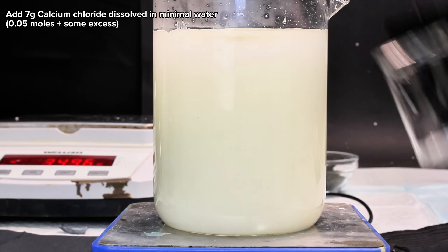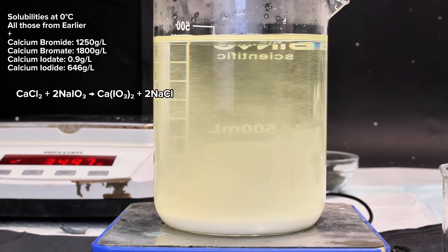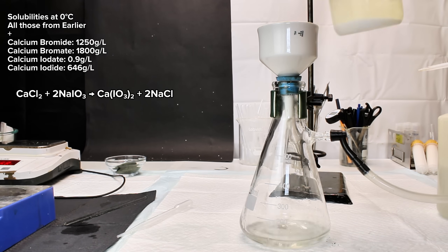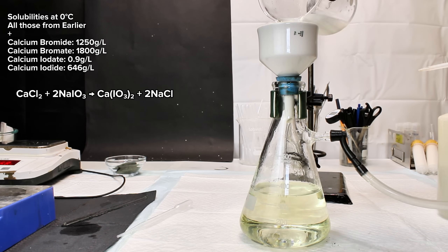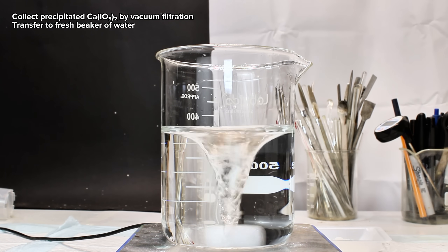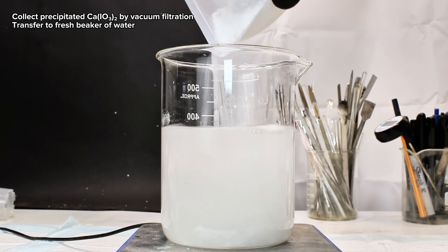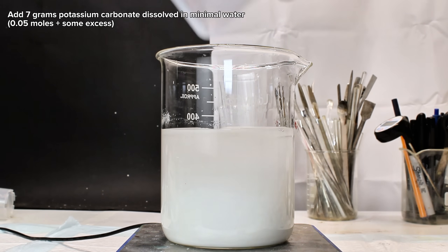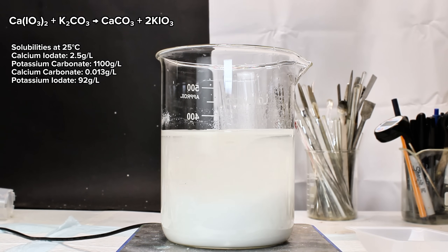This addition immediately began to precipitate the barely soluble calcium iodate, while any bromide, bromate, or iodide would stay dissolved. The calcium iodate was then collected by vacuum filtration and immediately transferred to a fresh beaker containing 300 milliliters of distilled water. To this, I added a solution containing 7 grams of potassium carbonate dissolved in 50 milliliters of water. This was allowed to continue reacting for an hour under constant stirring to assure that the reaction went to completion.